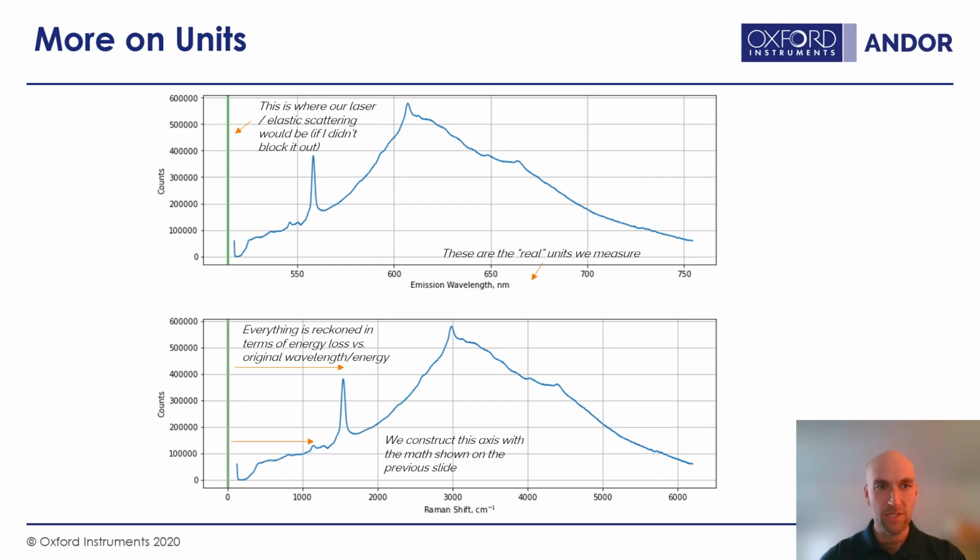So this happens to be done with 514 excitation, and there are some interesting things that happen as you move the excitation wavelength around, up and down in terms of wavelength, not physically up and down. Because this is now invariant with different wavelengths, these Raman shifts are always the same in energy, not in wavelength. So if I were to overlap, say, a 647 excitation or a UV excitation somewhere in the 200-something, 230 nanometer range, it wouldn't overlap in wavelength, but it would overlap in Raman shift. Maybe I should have actually had one of those. That would have been neat, but next time.